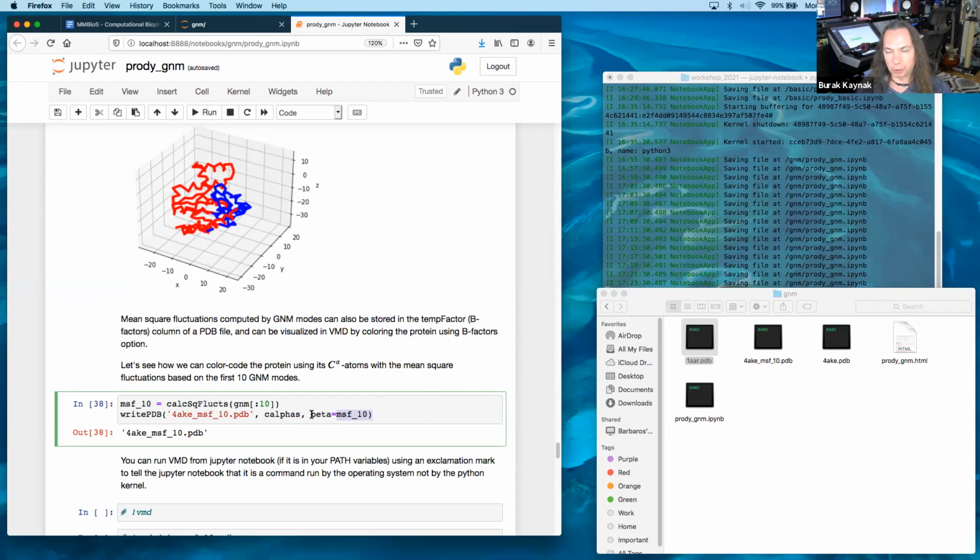There was a question just before the end of the first session. The person, I don't remember his or her name, so sorry about it, could not show the secondary structure. Yes, I will show you how you can obtain a full-fledged cartoon representation in the ANM tutorial.